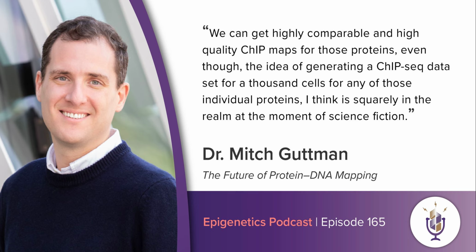We would be able to tell all the chromatin that was in this isolated microfluidic chamber with this antibody type is for this protein. It binds to this protein. But that's hard. There are many, many technical challenges there that make that not feasible. But what split pool allows us to do is effectively mimic the ability to isolate and define individual beads so that we can map the composition of each bead uniquely.